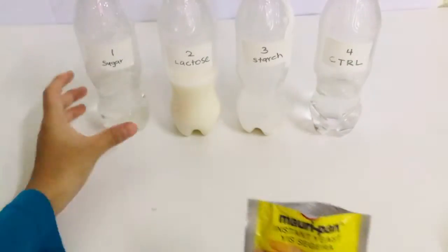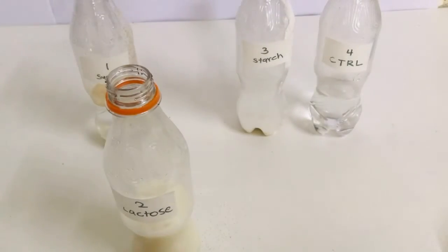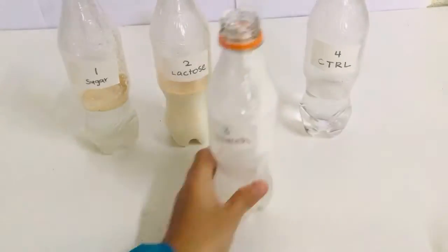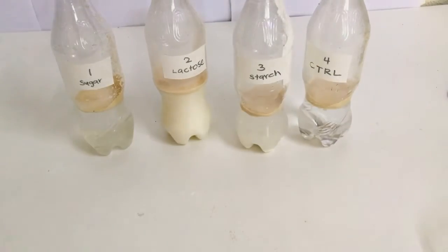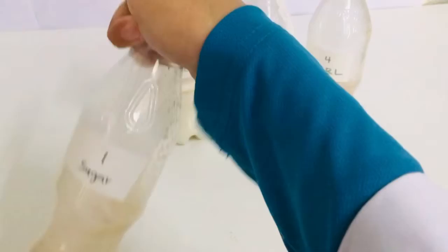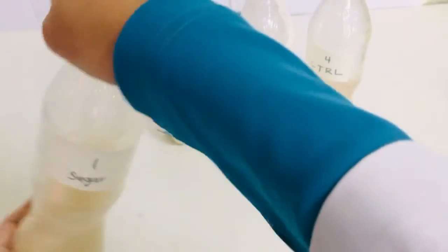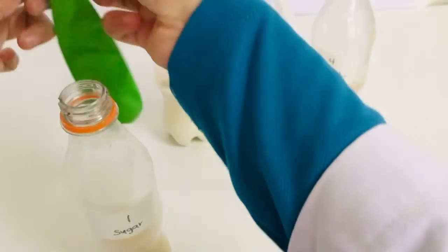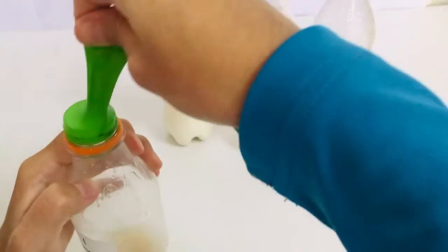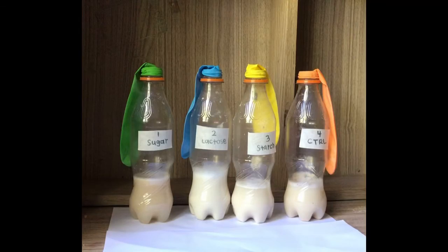And then, add 1 spatula of dry yeast into each bottle. Mix it by putting hand or thumb over the top of the bottles and gentle shaking. Cover the opening of each bottle with a balloon to seal the end of the bottles. Lastly, observe the bottles and record the observation for every 5 minutes for 25 minutes.